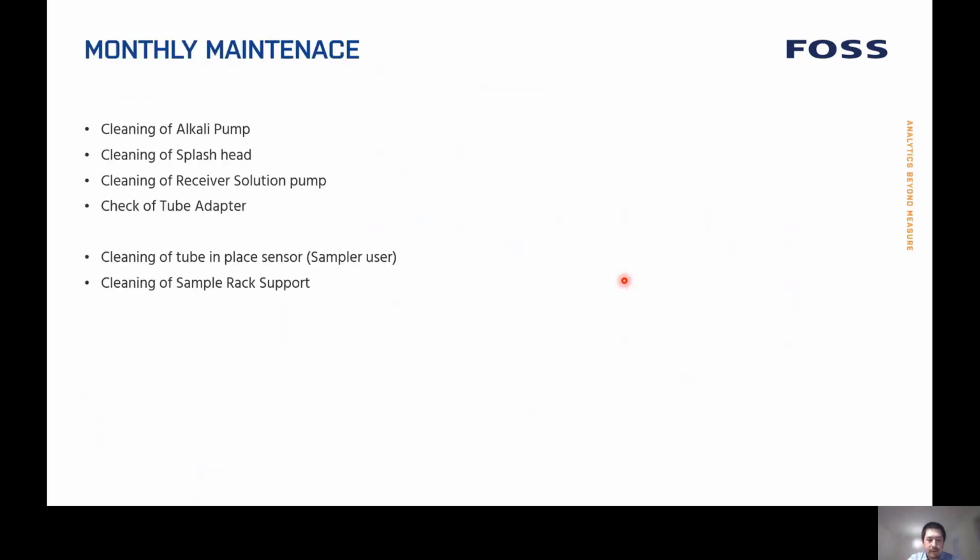The other thing is monthly maintenance. You have to clean the alkaline pump and the receiving solution pump. I will show a video of those procedures. You also have to clean the splash head, and I will also show a video for that.